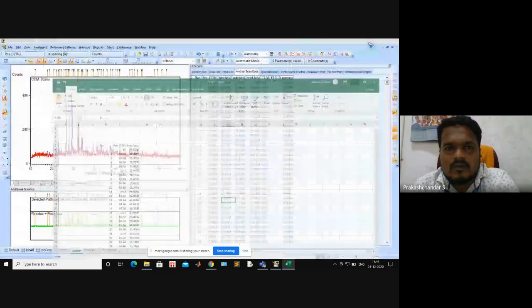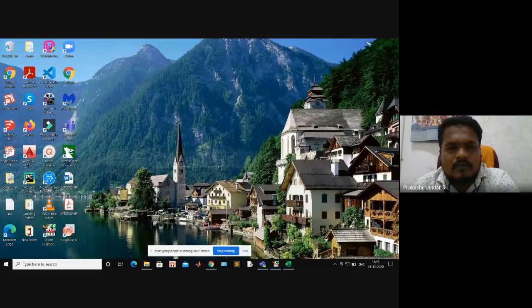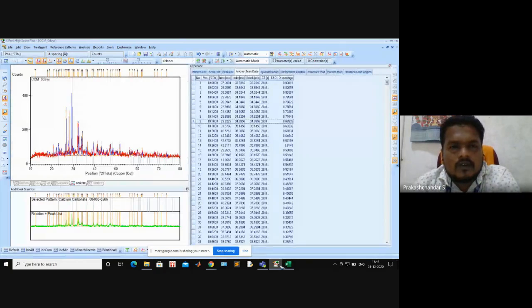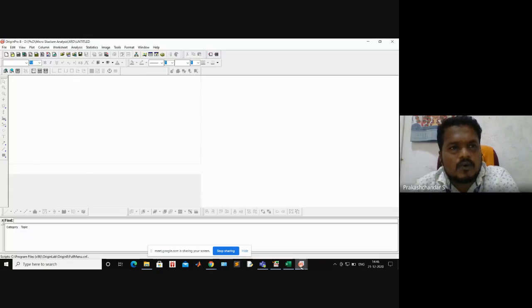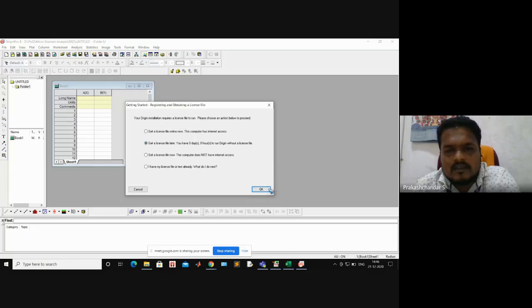And now another software, that is Origin 8 Pro. So here Origin 8 Pro is there.